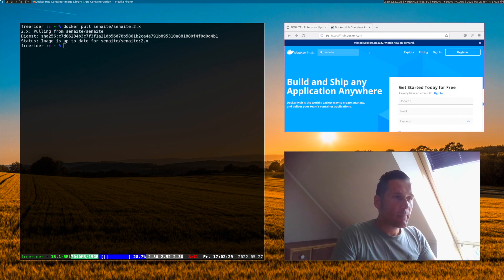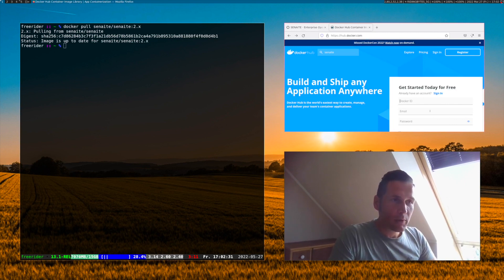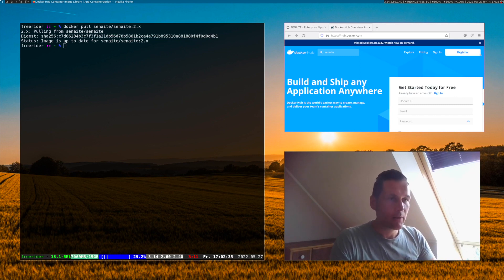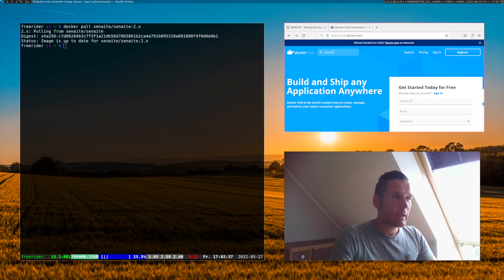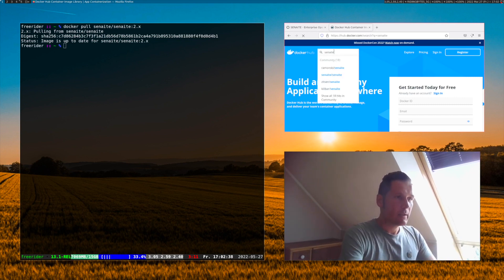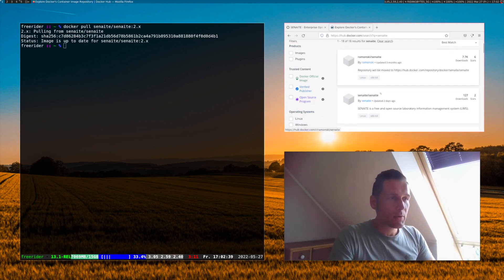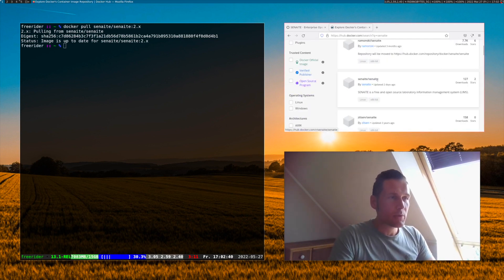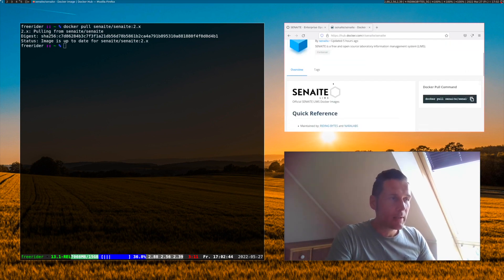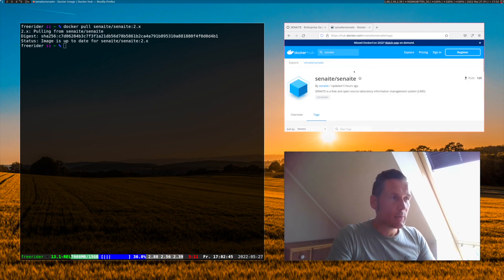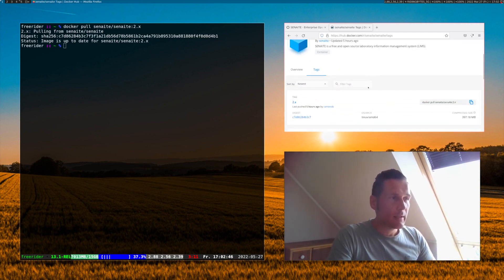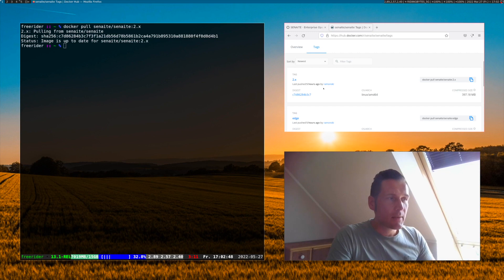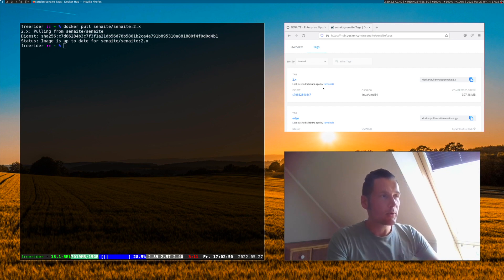It will look up here in hub.docker.com. You don't need to be registered or need an account there. It simply downloads the version from the Senn8 organization, the Senn8 repository. And here we see already tag 2x is downloaded on our local computer.